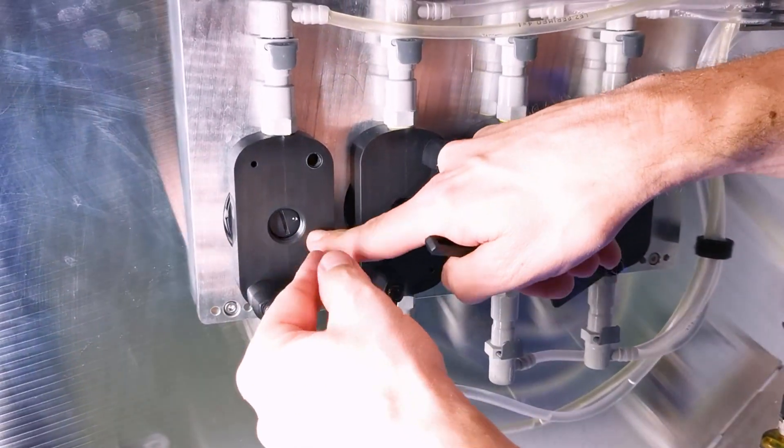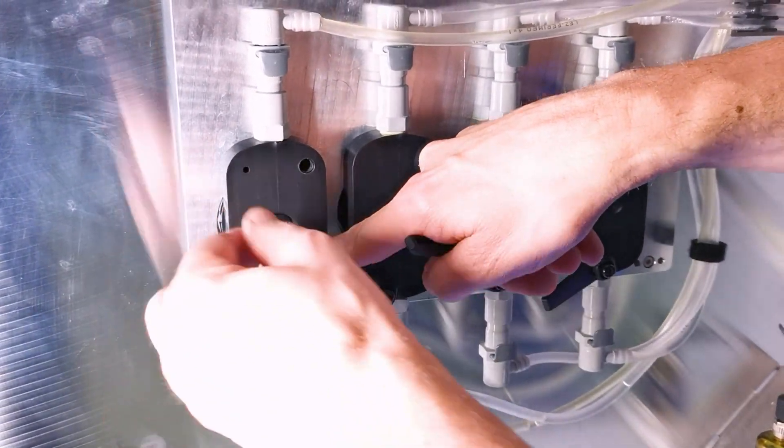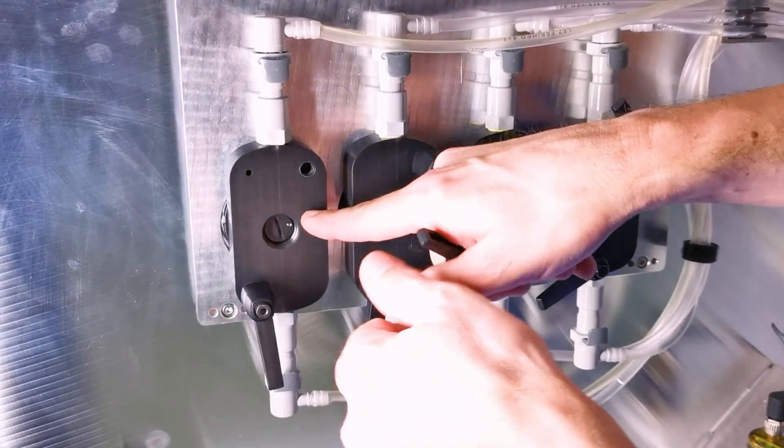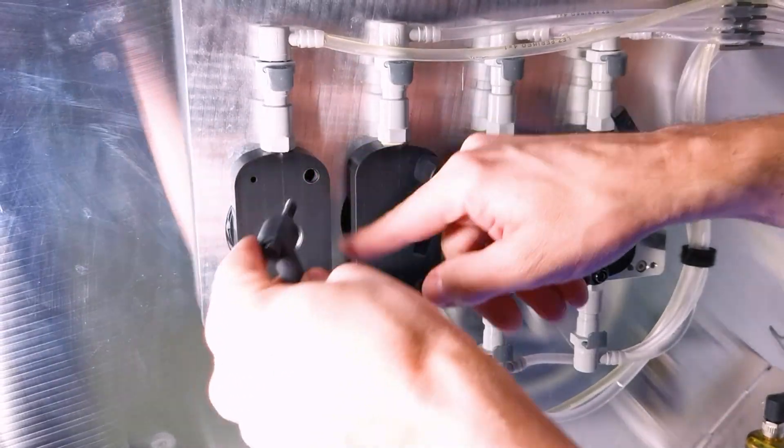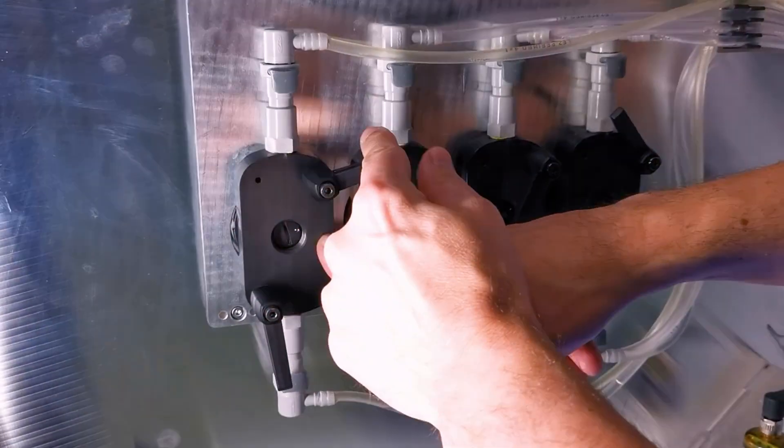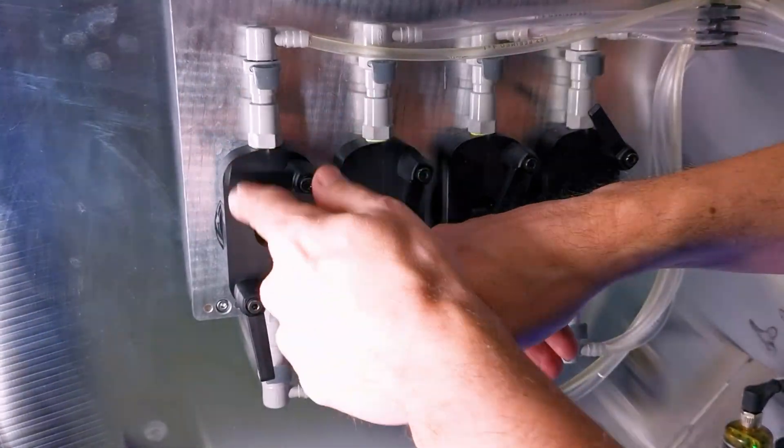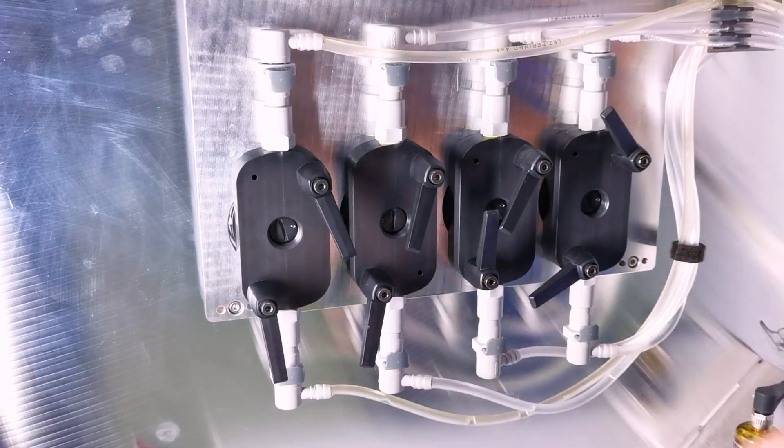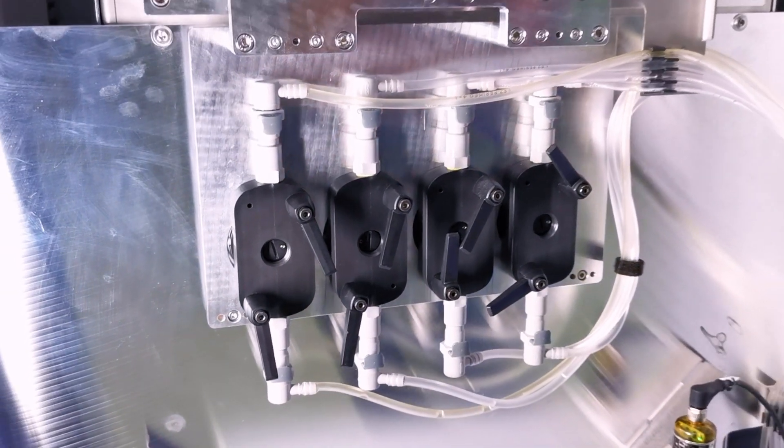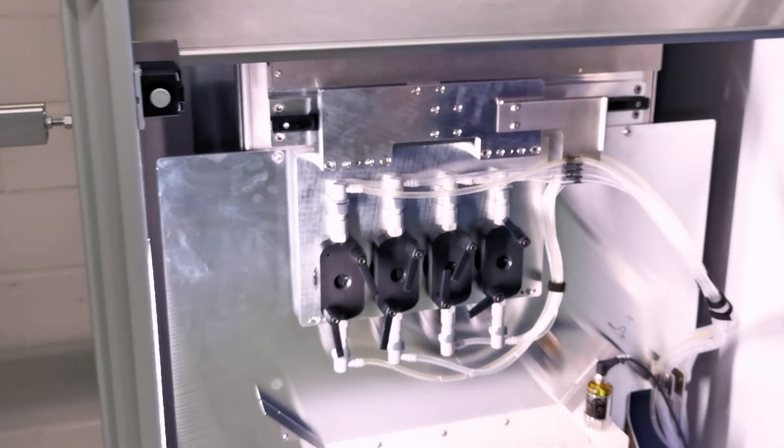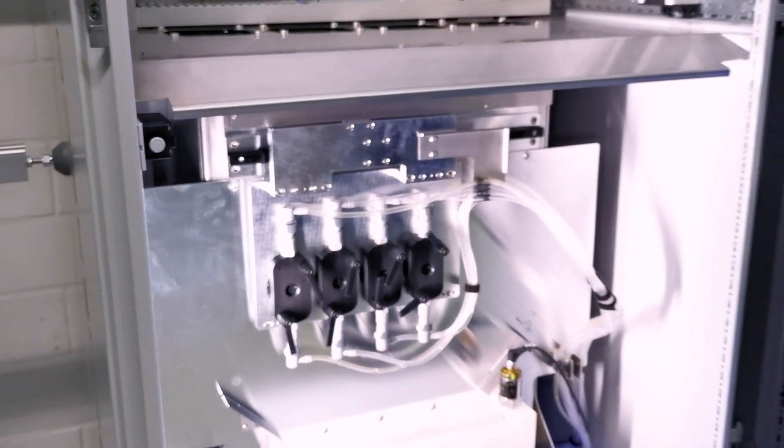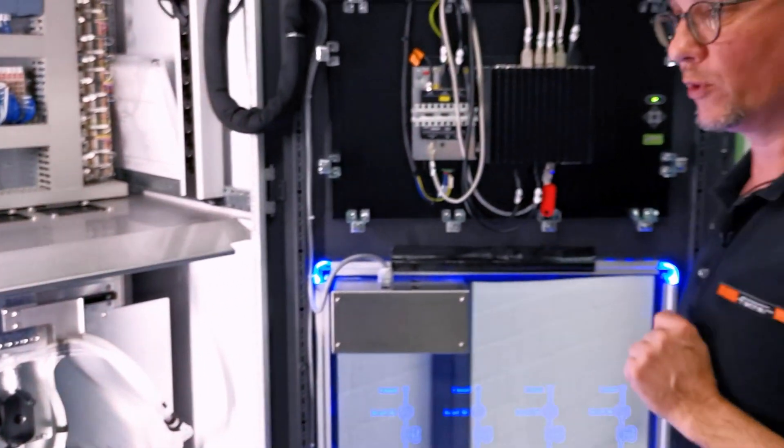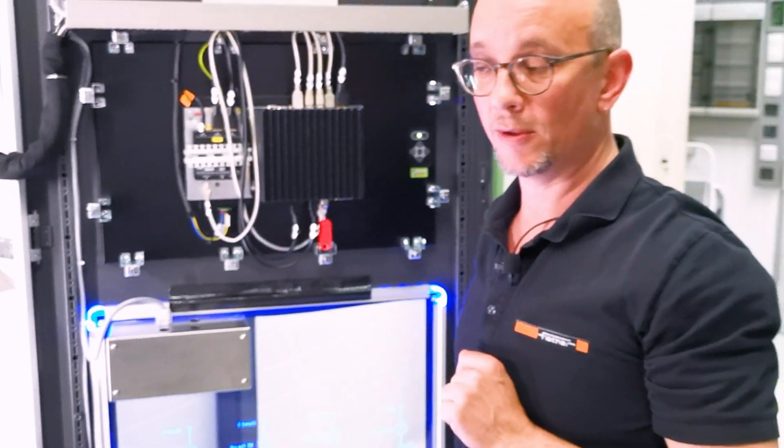And this is a precaution for potential problems. Our operation experience shows that we can run much longer than one full-time year without any problem.